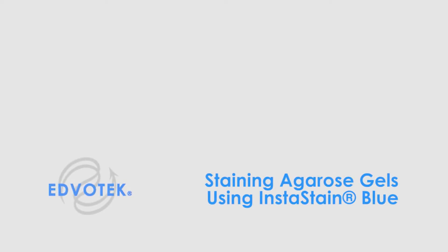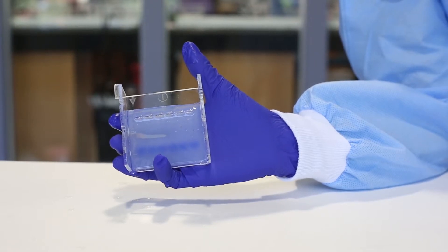Edvotek instructional videos: staining agarose gels using InstaStain Blue. For this experiment you will need an agarose gel, a plastic tray with buffer, and InstaStain Blue.